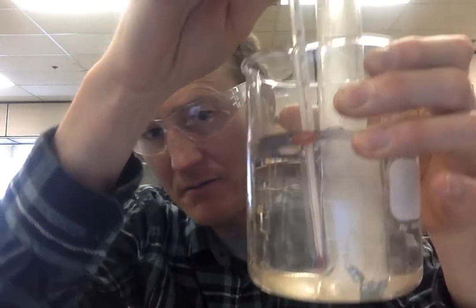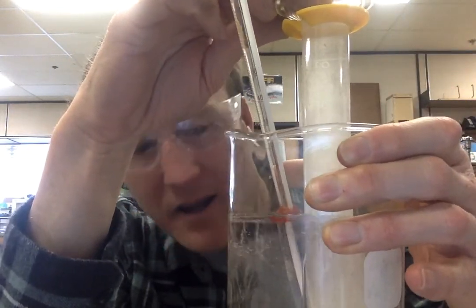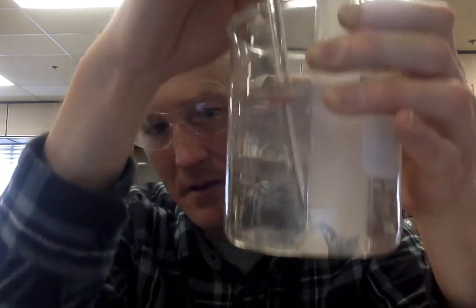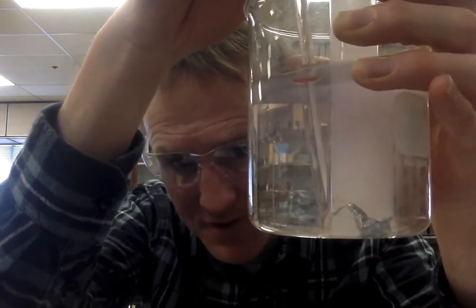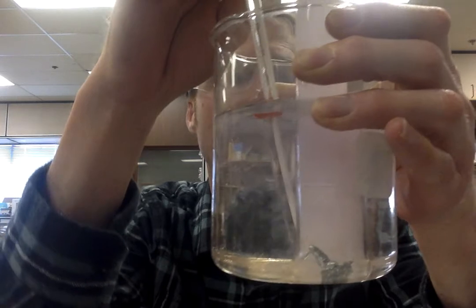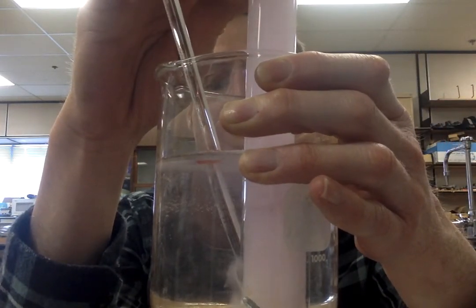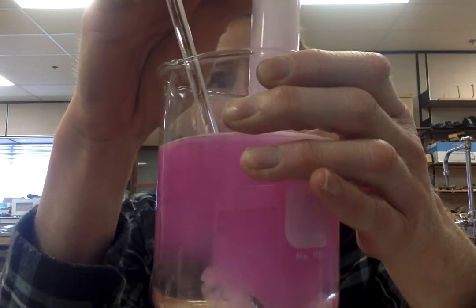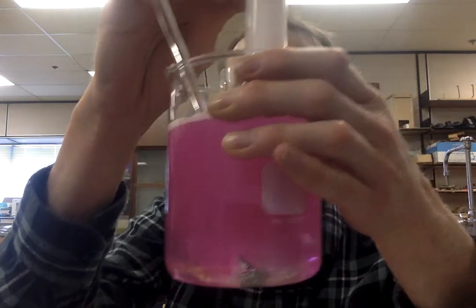Again, you should be able to see, oh, you can't see because it's not properly. We've got a gas being produced. The calcium is what's doing it. You can also see the zinc in there, but the calcium is making the gas. There was phenolphthalein in here as well. We're seeing that color change again. And the vial is full. And that was really dumb of me because there was detergent in this one as well.